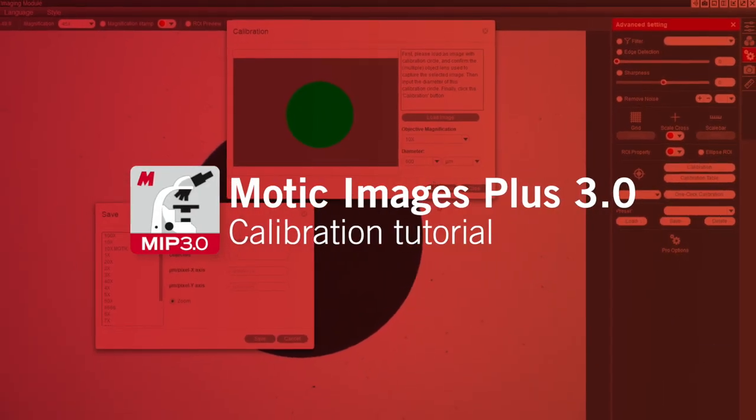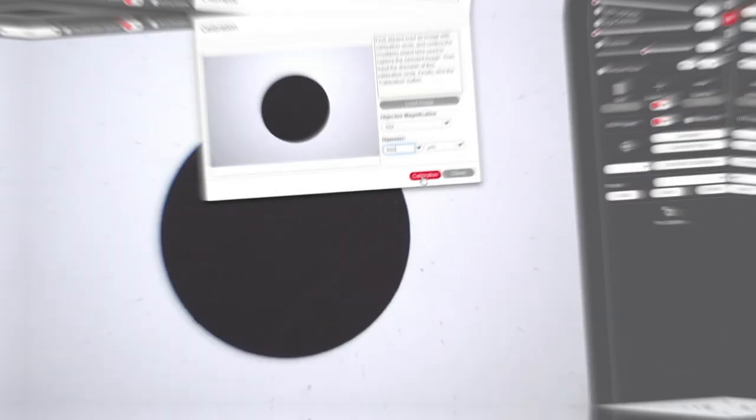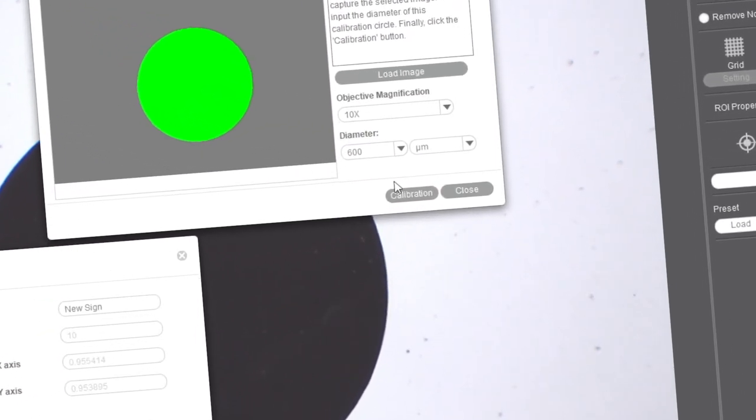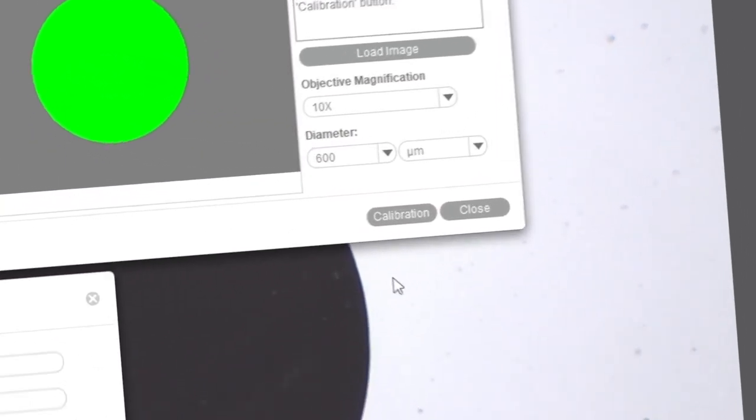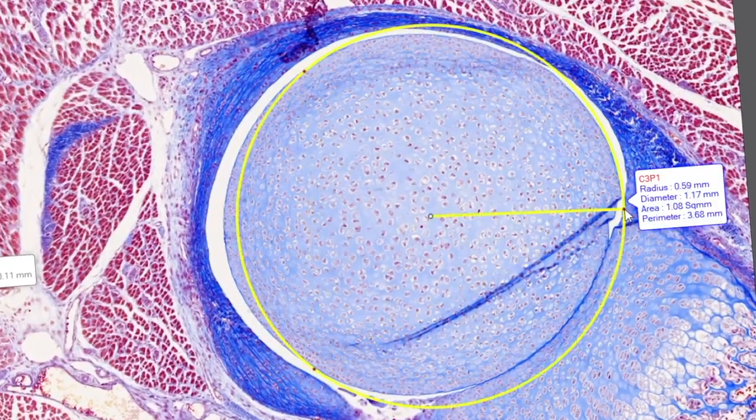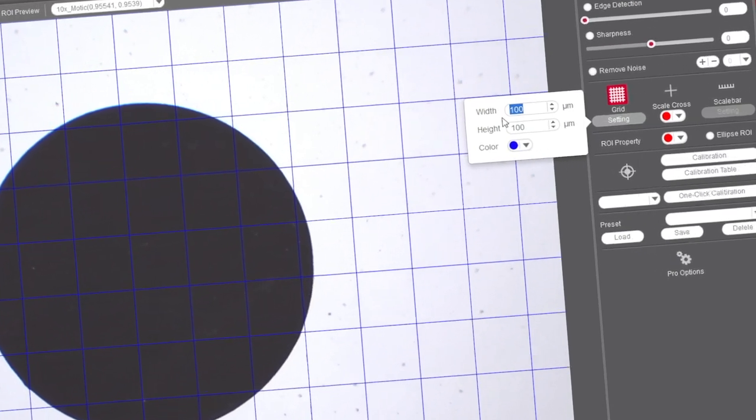Welcome to our tutorial about how to calibrate your digitalized device workstation. Calibration is only necessary if you wish to use the measurement functions of the software, or to apply the scale bar or grid options.